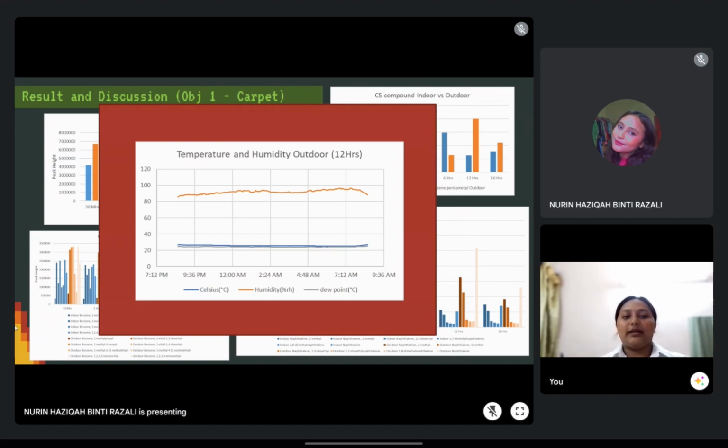This data shows that the humidity during the weathering of this sample appears to be higher, between 80 to 100% humidity level. So the increase of the peak height of the high molecular compounds may be affected by the amount of humidity, causing the compounds to elute much faster.